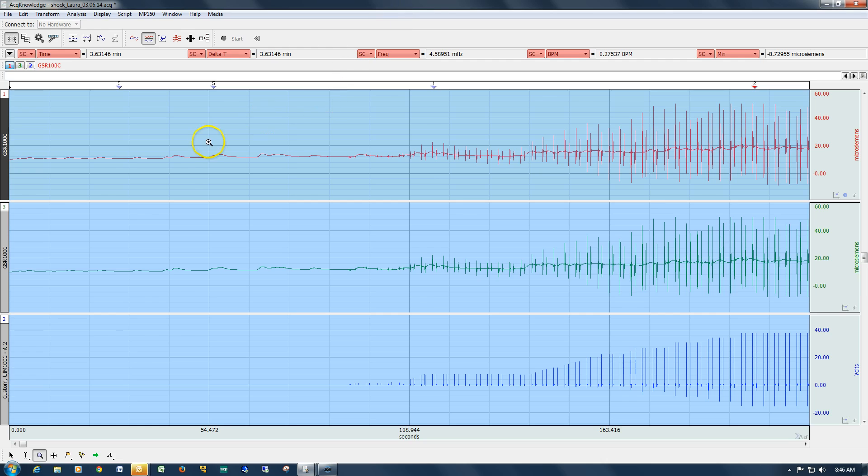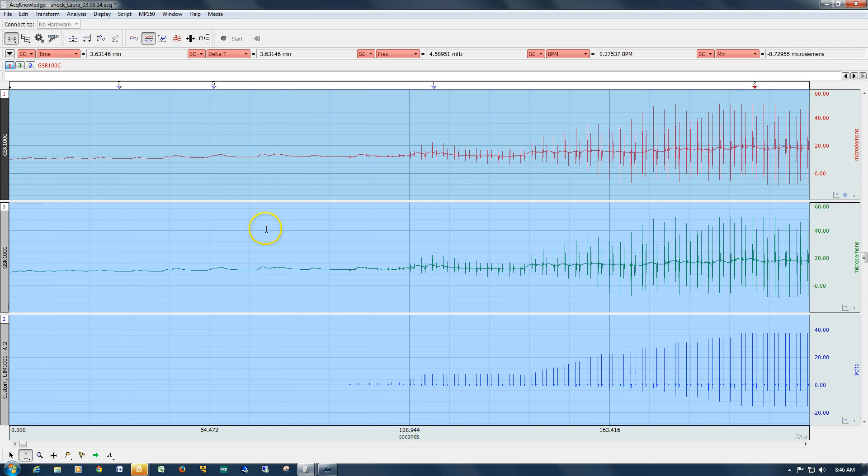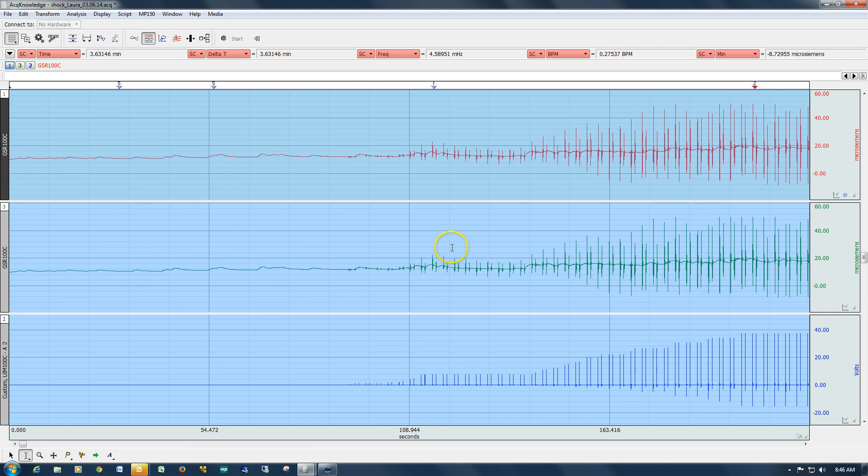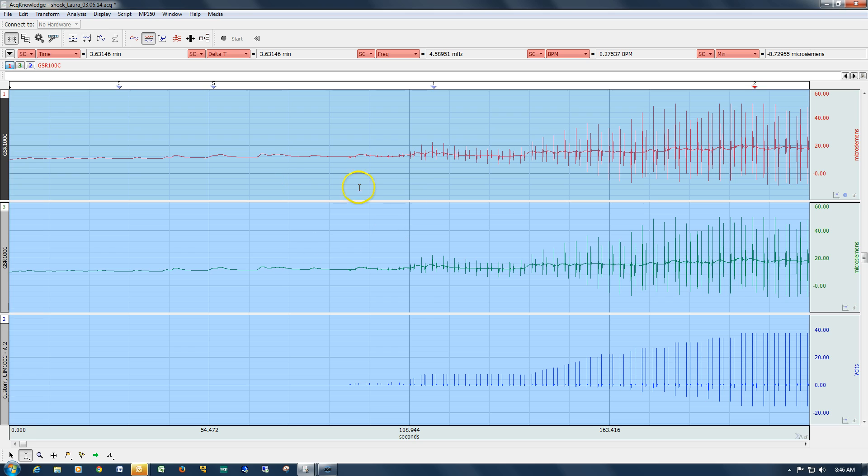So now we've got another file, and this file contains a duplicated waveform. The top one is electrodermal activity, and the second channel here, or channel 3 as it's numbered, is a duplicate of the same waveform. This data was recorded at about 30 samples a second, and down below we've got the output from a stimulator.